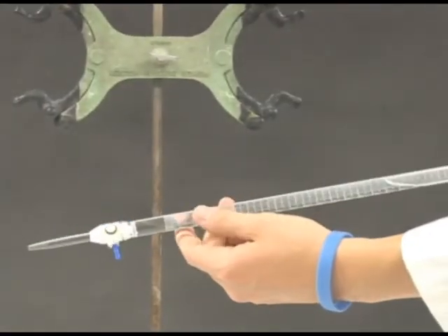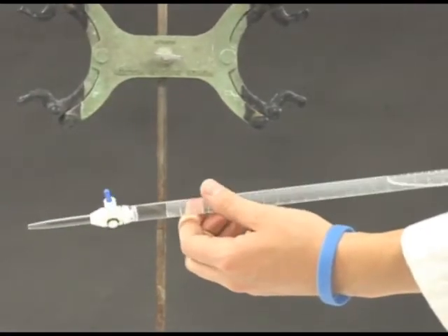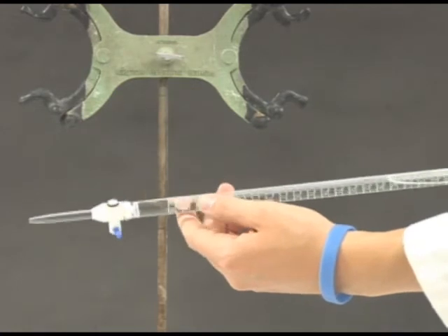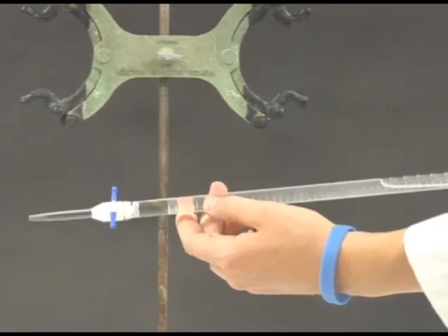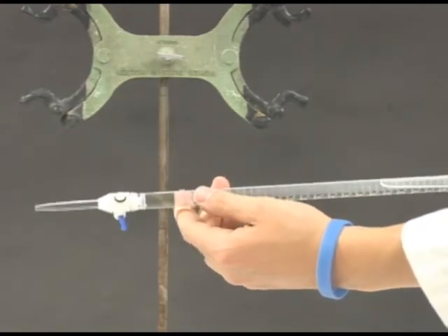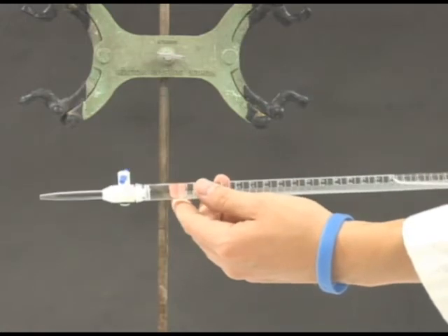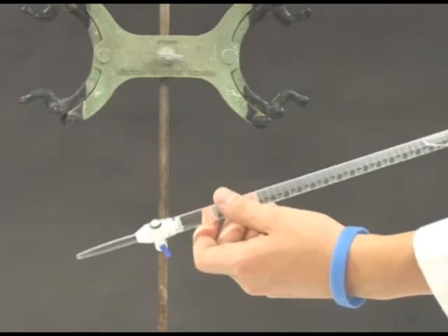Rinse the burett again by adding a few milliliters of solution and rotating the burett to rinse the entire surface and tip. This is done so that the concentration of the solution is not diluted by water.